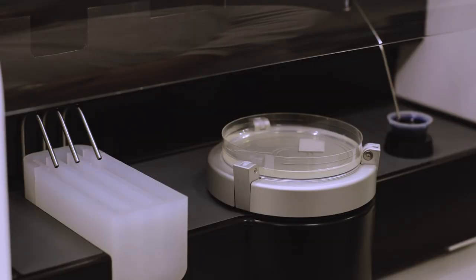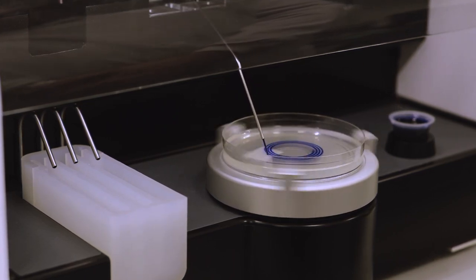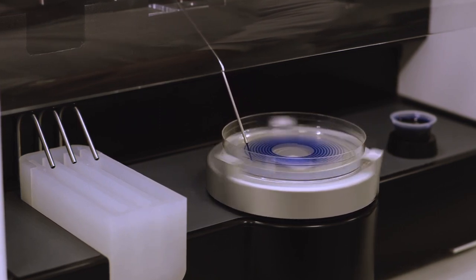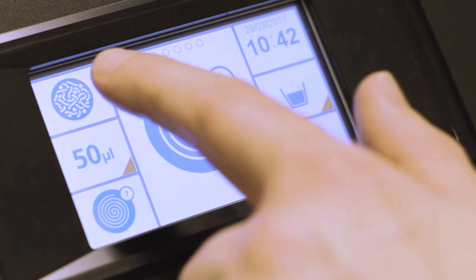Wasp Touch performs the equivalent of 3 logarithmic serial dilutions across a 90mm plate and 4 logarithmic dilutions across a 150mm plate. A wide range of deposition volumes is available to optimize your sample processing.